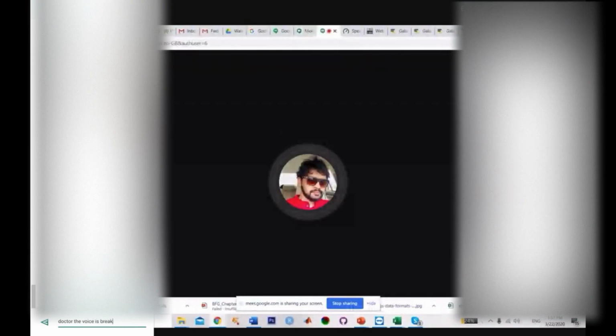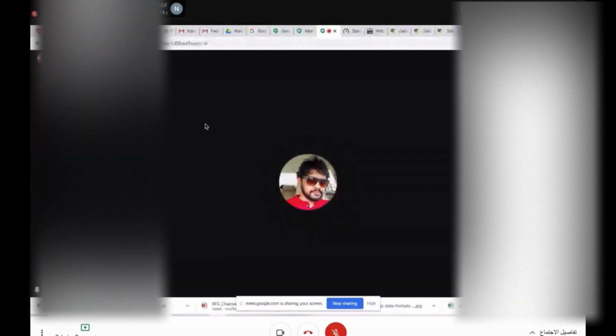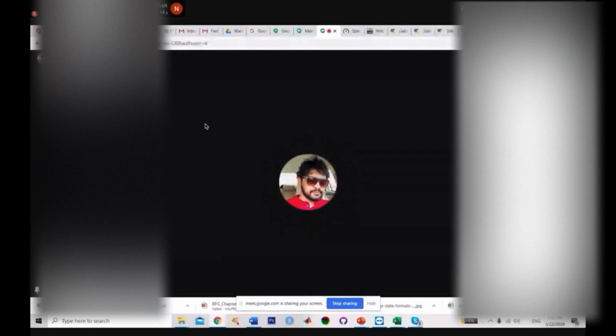So it will cut down the poor reads, the low quality scores. As I told you, now we are not using Trimmomatic, which means whatever we are getting is already very high quality. Now we set up this alignment. You can see this information. Do this alignment. Okay, let's stop this one here.